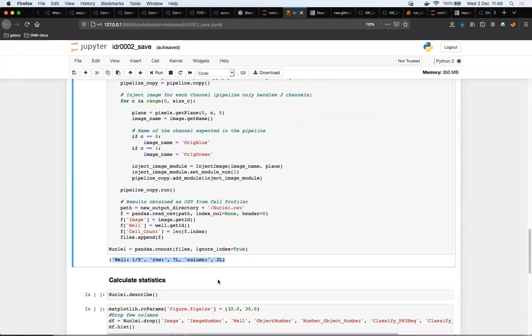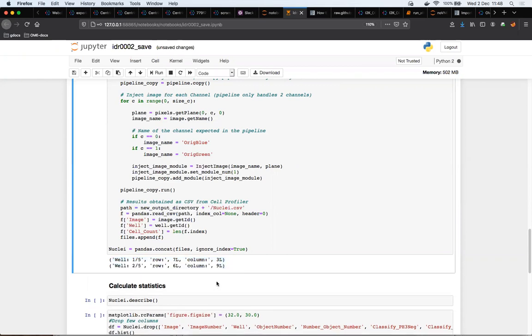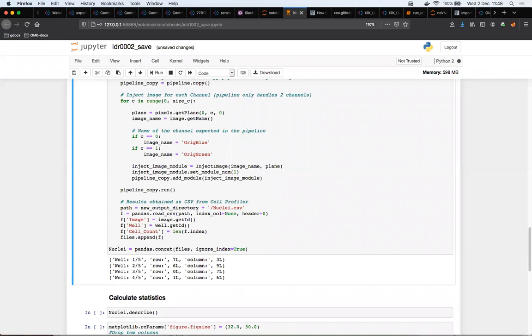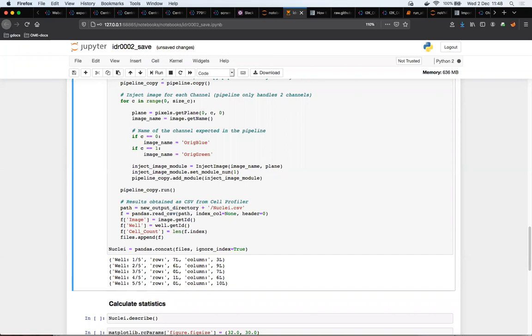Then you say, okay, I'm going to do that well, and when it's finished with one well, it will just do another one, etc. So what type of analysis tool do you mainly use on your images? Is it mainly Fiji, or your own scripts, or MATLAB? Because we have bridges, as Peter indicated, for most of them except MATLAB. If you go to the OMERO guide, Python, R, etc.